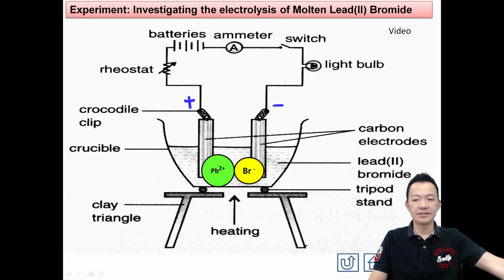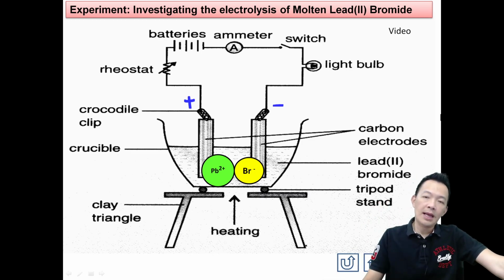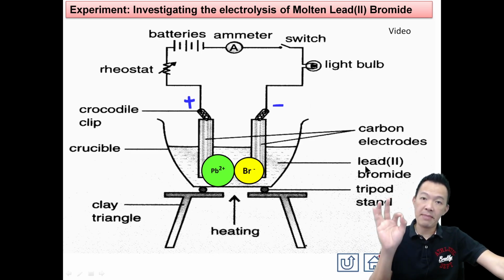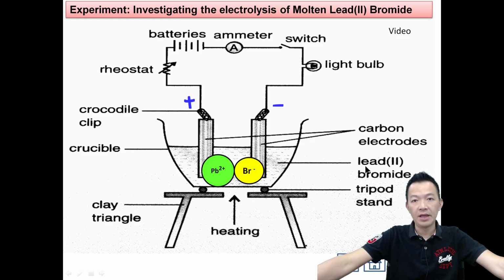什么事情发生 Lead bromide actually is a white color powder. 它是一种白色的粉子 And we prepare lead bromide for one reason only. Because the melting point actually is quite low. 它的熔点会比较低的 Under 450 degrees Celsius 450度左右 So your Bunsen burner can melt it 本身灯就能把它熔掉 okay?